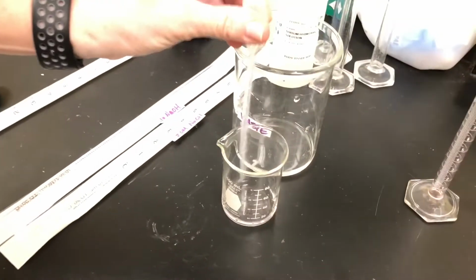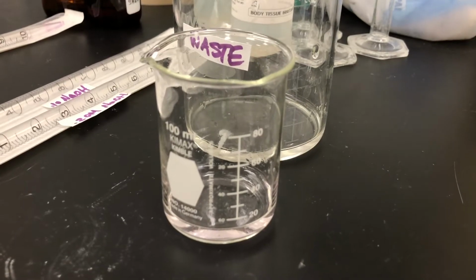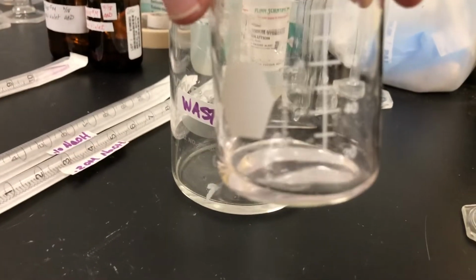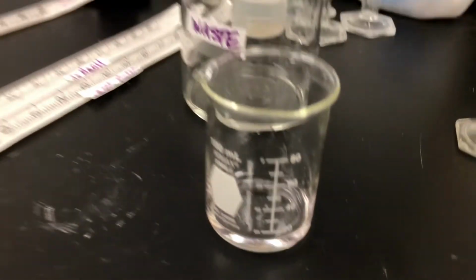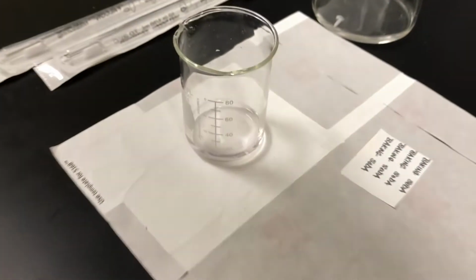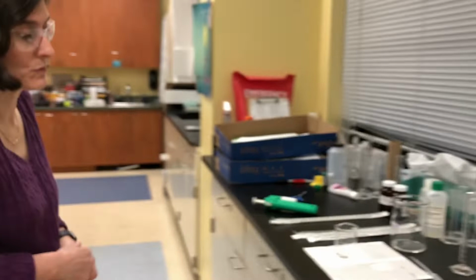But if you look back at our beaker with our combination of crystal violet and sodium hydroxide, you can see how it's considerably more clear now than it was when we started. And let me see if I can get, yeah, you can see now it's getting clearer and clearer as it goes on. And that's why it's kind of important to work quickly because, as the reaction proceeds, it will eventually get to a colorless position.